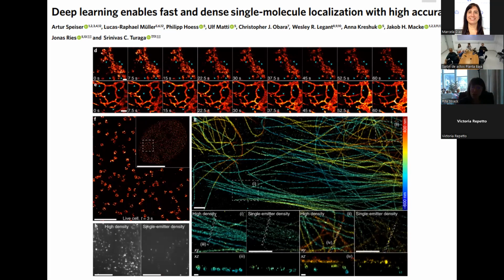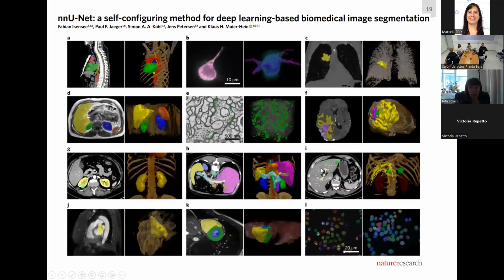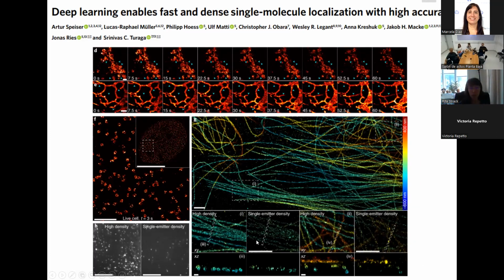I really had to push the authors here to do a live cell demonstration, but they did. They ended up showing me live cell imaging on 2 different structures, changing longitudinally and on NUPs. So I thought this would end up being a really beautiful demonstration. And then they show some of their more standard fixed cell imaging as well, and what they're able to achieve in the Z dimension. So I thought that was a paper that has really nice demonstrations showing what you can do.